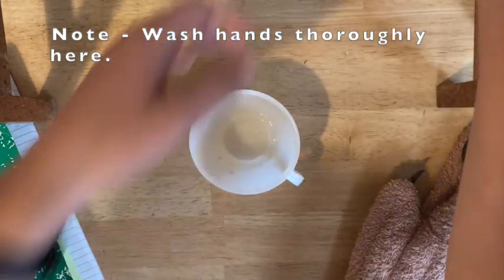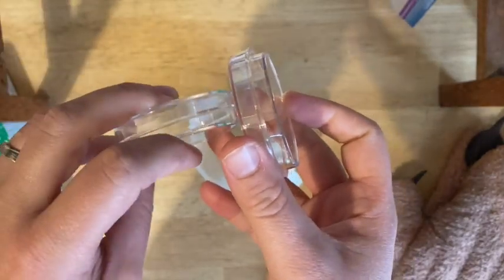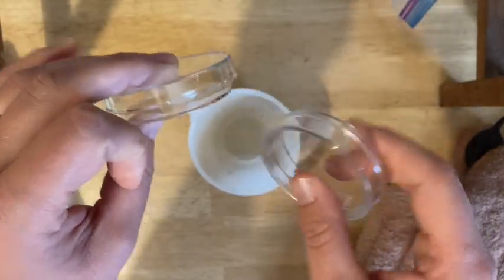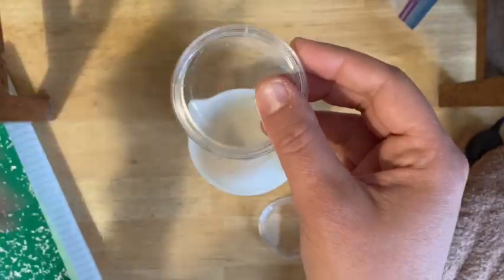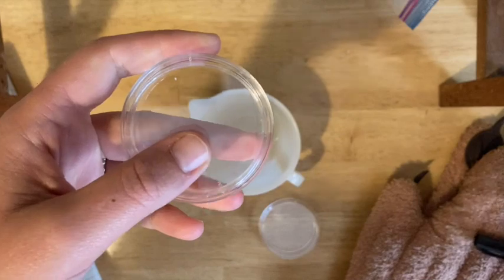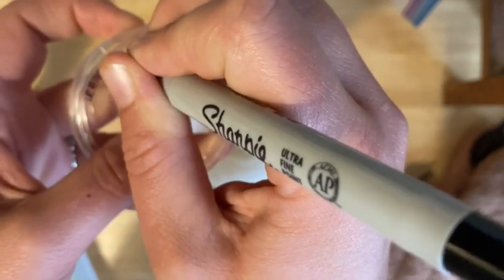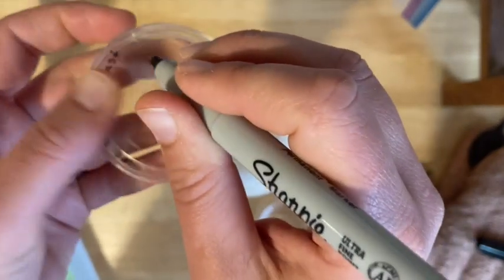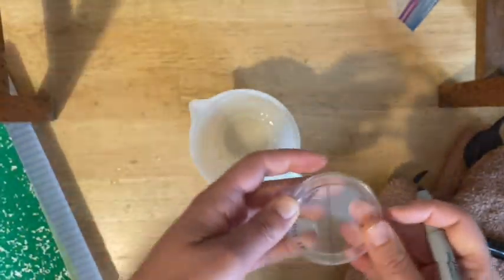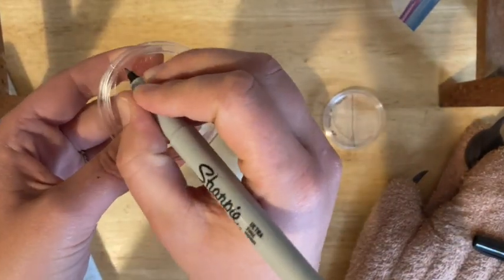Grab your petri plates — you should have two. Label them on the bottom: the bottom is the smaller circle and the lid is the part that goes over. Flip it upside down and write nice and small around the edge — your initials, the date, the period, and what's going in, which is yeast. Draw a line right down the middle to use later. Do the same for the other plate, keeping it closed as much as possible. Wear your mask so you're not accidentally spitting, and make sure your hands are very clean.